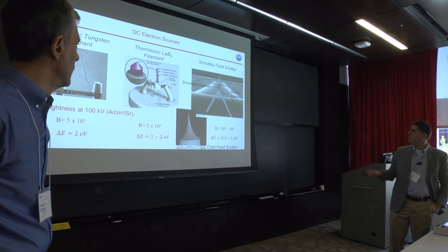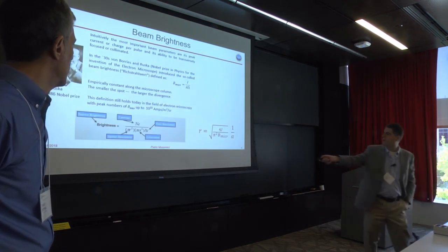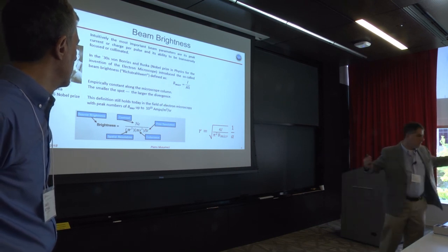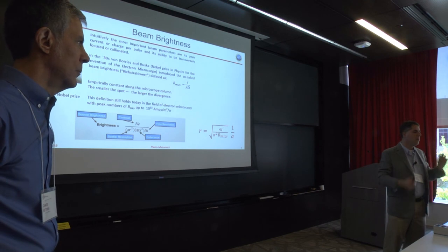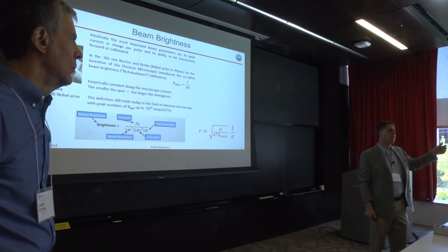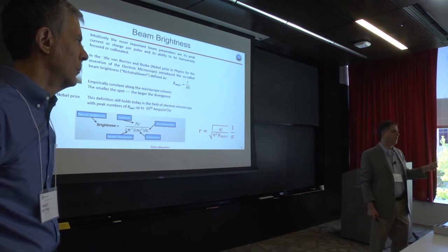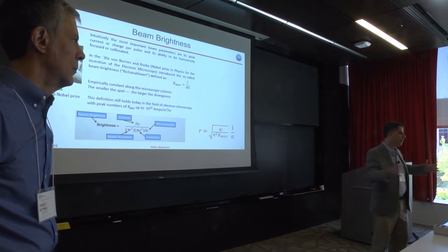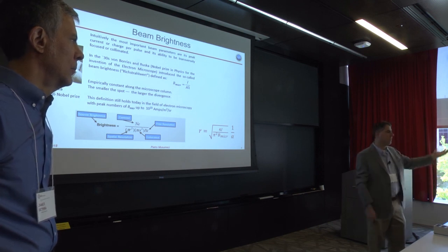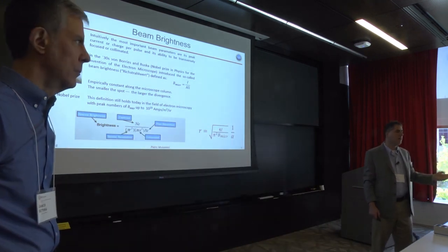Yeah, the easiest way to see what the challenge is going to be is, as I make that delta T smaller and smaller, I end up throwing way more electrons. The usual challenge with ultrafast is I can do it with 1 electron per bunch. That's easy for diffraction, but very hard for imaging, because if something moves and I take a diffraction pattern, I don't care, it doesn't change the diffraction pattern. But if I'm trying to image and something moves, I'm dead.